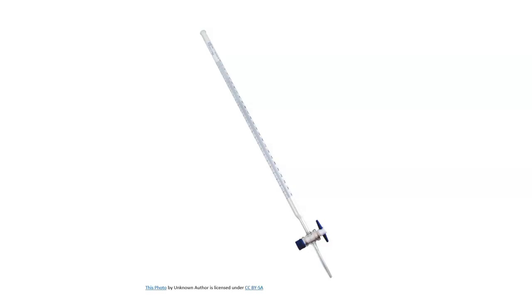You're never going to be able to read 5 or 10 mL on a burette anyway, so don't try to break your back doing that. So you're going to tilt it sideways, and you're going to roll the barrel to completely rinse the inner walls, and I'll show you how to do this in lab. You want to make sure that the tip is also conditioned. So you're going to go into a waste container, because we never put chemicals down a drain. You're going to open that stopcock over the waste container, and you're going to let it drip through, and that conditions the tip. You'll do that 2 times.